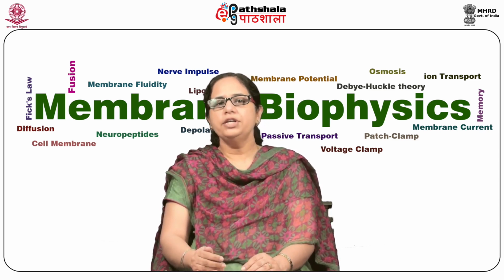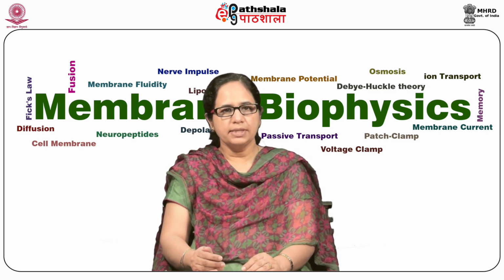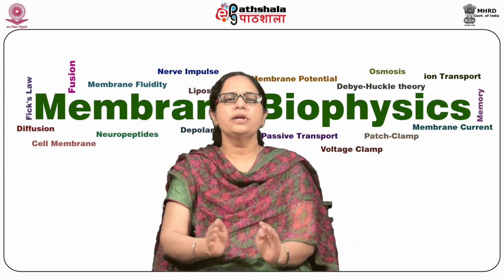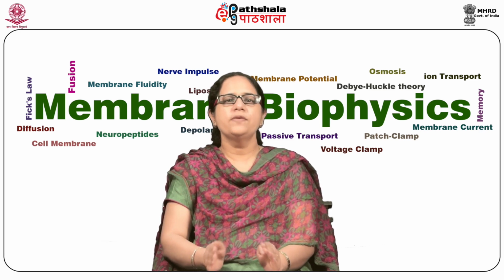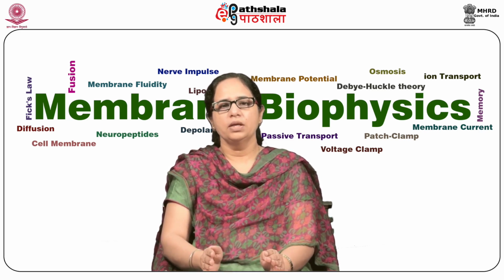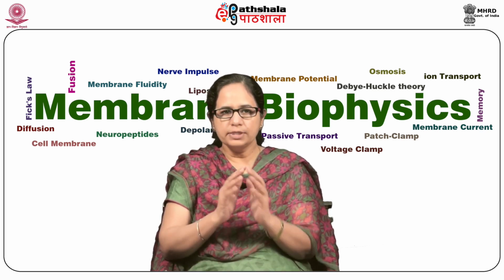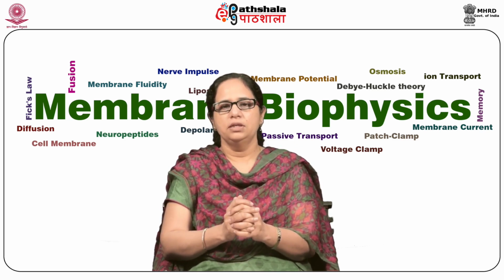The great advantage of patch clamp in cellular physiology is that it allows sensitive and reliable analysis of electrical activity of cell membranes at the molecular level. The patch clamp recording is the primary tool for studying structure and function of ion channels.